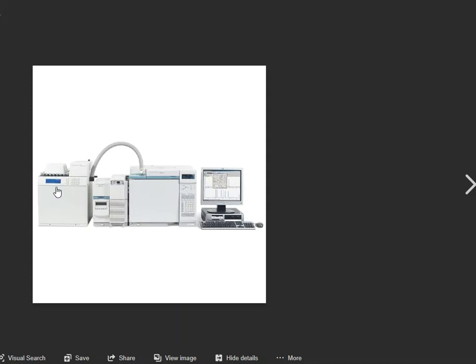And then this sample gets heated for a certain amount of time at a temperature that you've selected. And then once that heat process is over, there is an auto-injector needle that will then pierce the septum of the container, and then it will transfer that sample over into the GC unit.